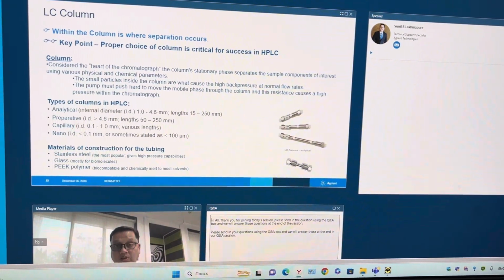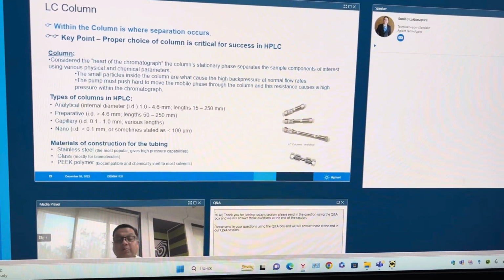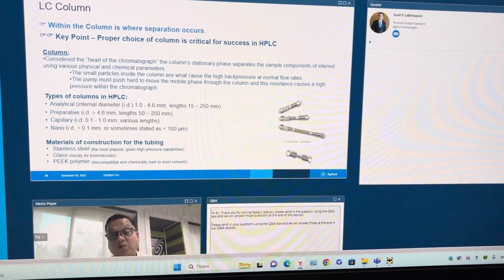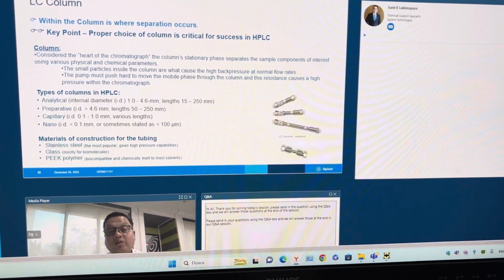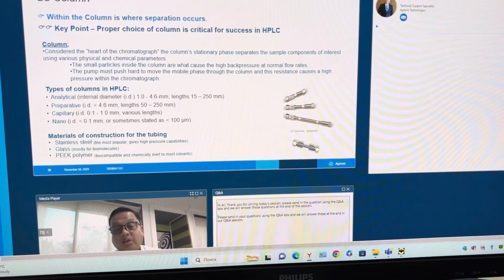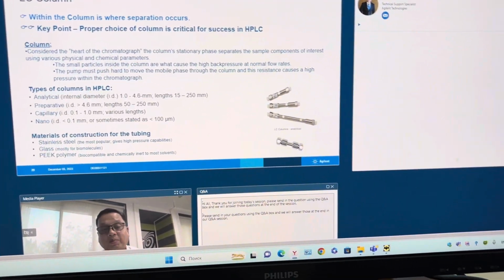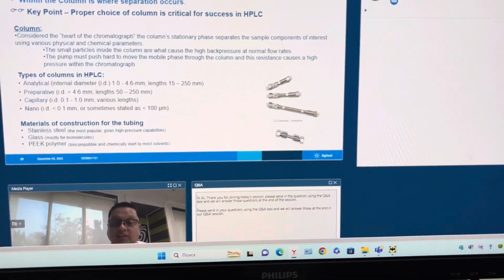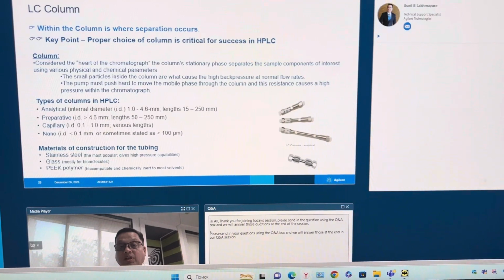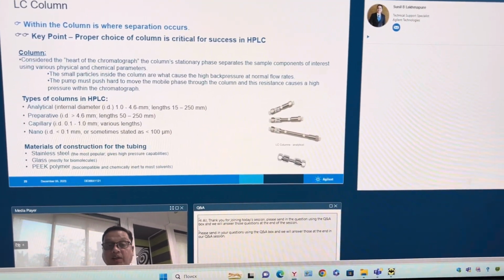Now, we have been seeing different consumables like sample preparation, sample containment, and mostly mobile phase filtration. Now coming to the heart of a system, the column. These columns are very important. This is not basically a column selection section, but they are very important, that's why I'm including it here. They come in varying sizes, like length, ID, and other things. It's very important that you maintain the column very healthy by using the right consumable.